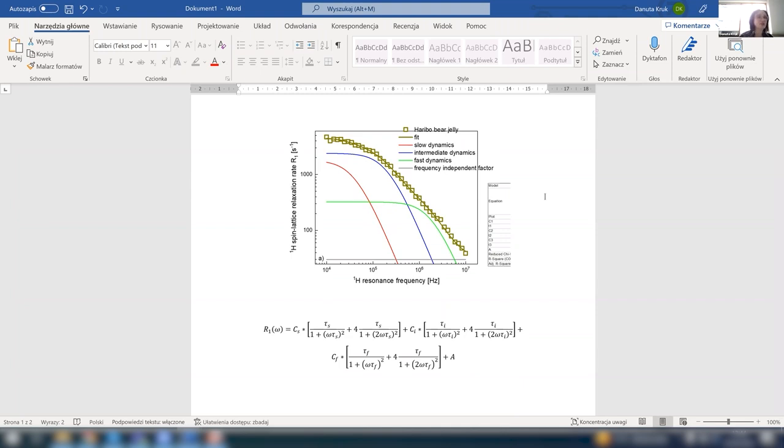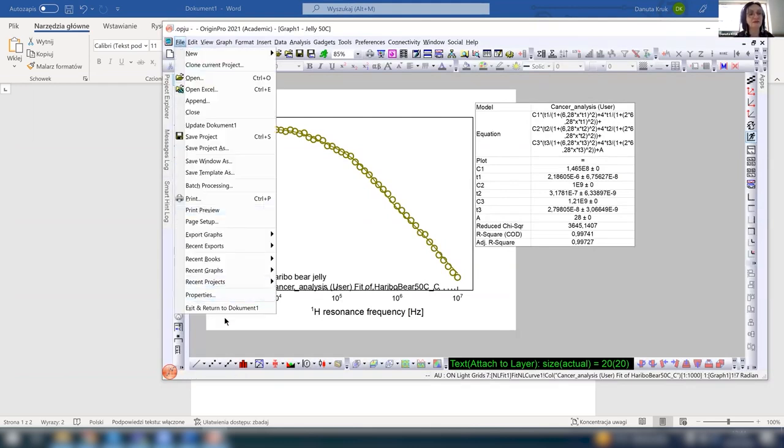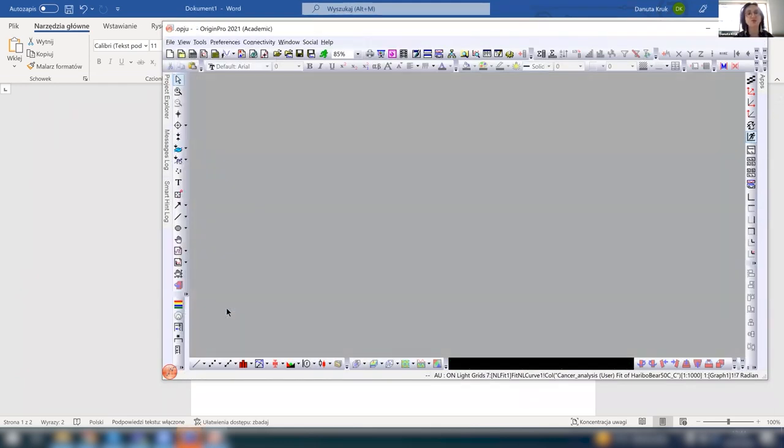But I wanted to show this to you because we still have time for the 3rd lecture, which I will use to fit some well-defined models for exactly those same samples. Then you will have a kind of comparison. But this is something which is always worth doing.